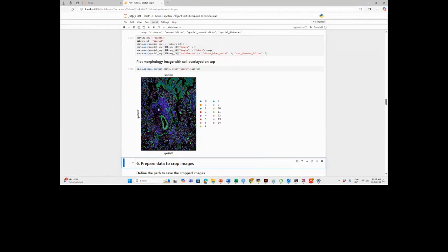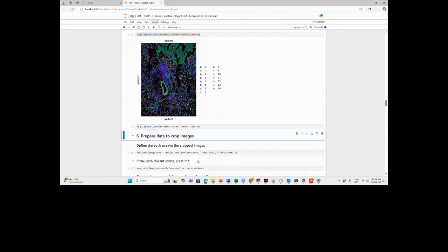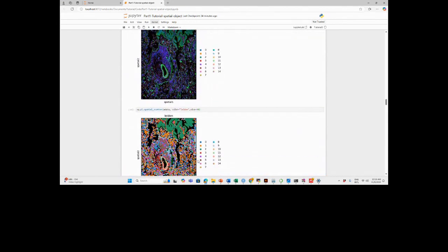Yes. So you can make two. Please open another section in which you do the opposite, right? After this one, now you make the cells larger. And we see that this is the overlap of two data sets right there. The transcription and the morphological images are within the same data set now. It's just to show that.